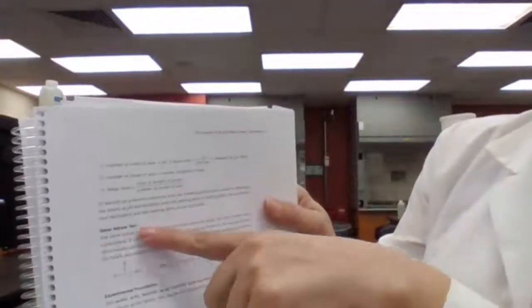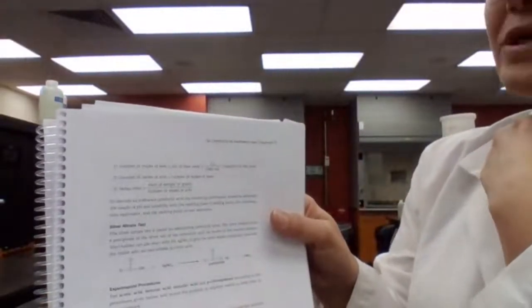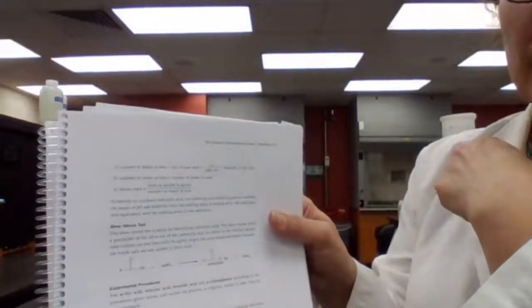So silver nitrate precipitates with most acids. Unfortunately, based on my experience, even though I have the procedure here, it is not a reliable test to confirm that you do not have carboxylic acid. But if you get a positive test, you do have it definitely. So the positive is strong. If you get a positive test with silver nitrate, it's definitely carboxylic acid. But if you get negative tests, you cannot deny it. You cannot say it's not carboxylic acid.